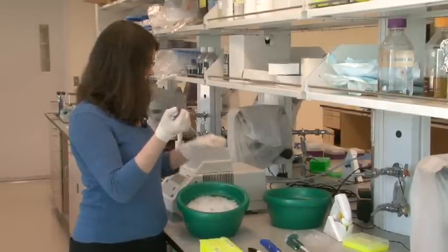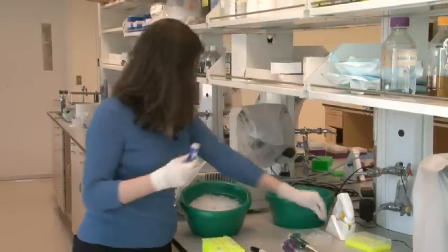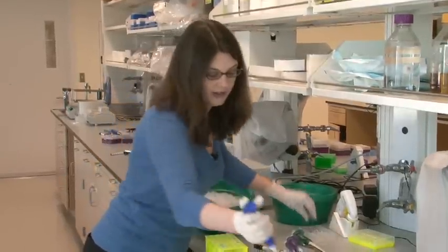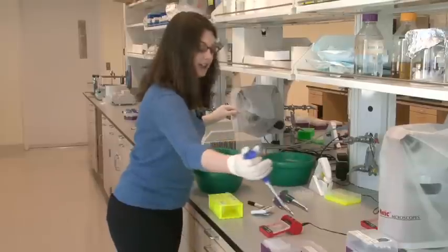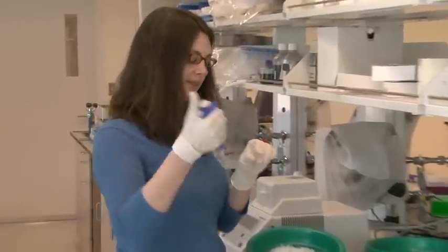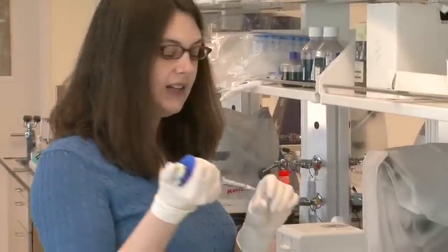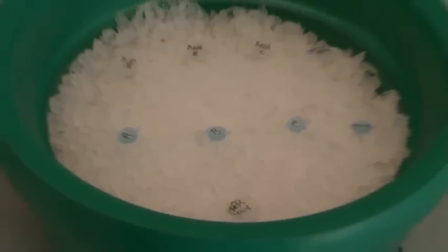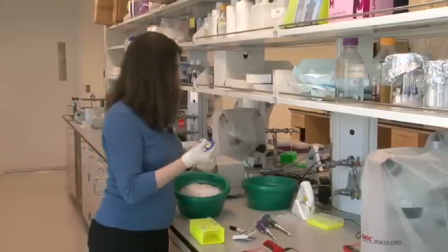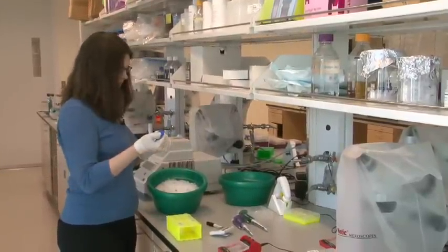So now that I have all my samples in the tubes, at this step, I'll be adding the mixture of all the chemicals necessary to do the reaction. So I have that here on ice in this tube. The reason I have everything on ice is because this reaction is sensitive to temperature, and so I want to keep all the reactions on ice until I'm ready to start the reactions. Again, I'm changing pipette tips each time so that none of my samples contaminate one another.